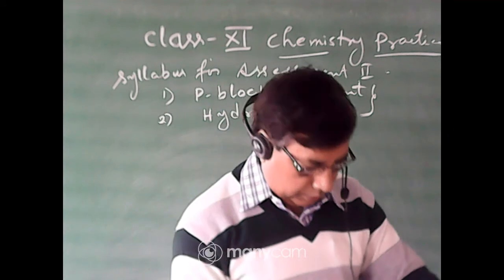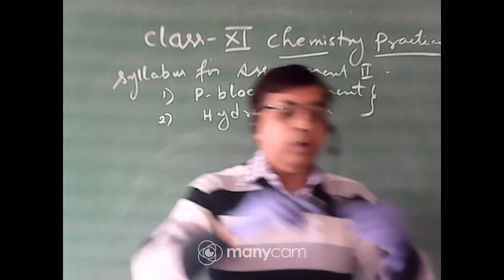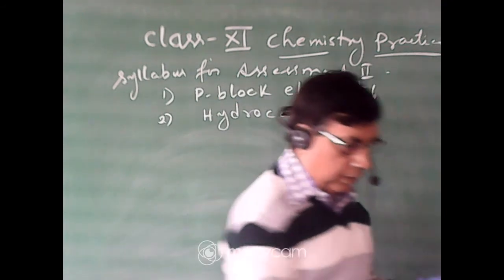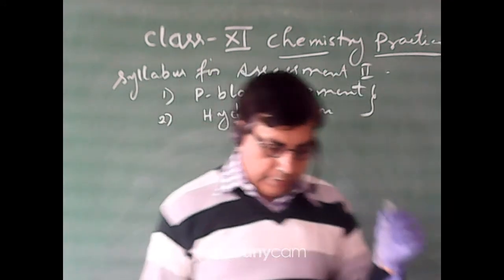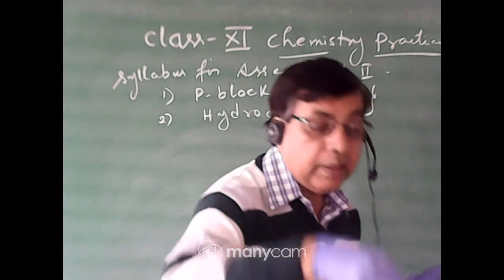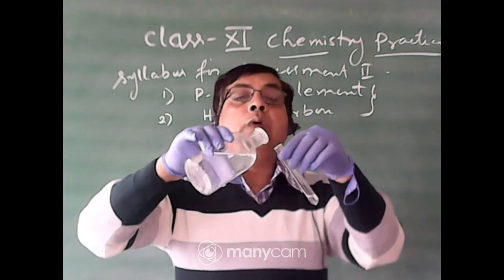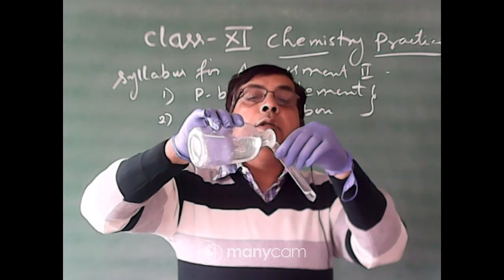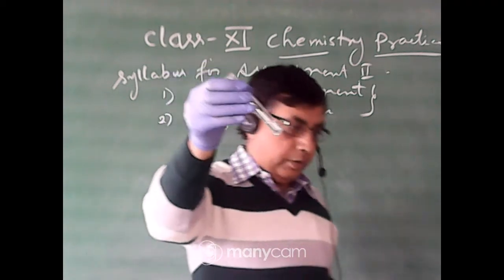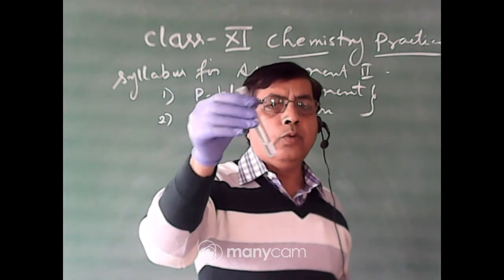Wash the test tube thoroughly. Take a small amount of solid sample again. For the sulfate test, you add barium chloride solution. Here also no precipitate is formed, meaning the given salt does not contain sulfate ion, chloride ion, bromide ion, and so on.